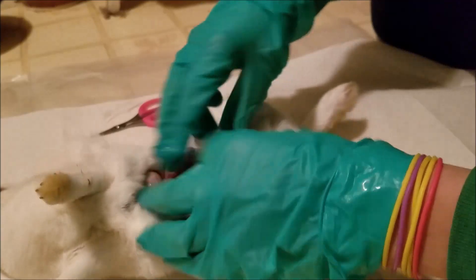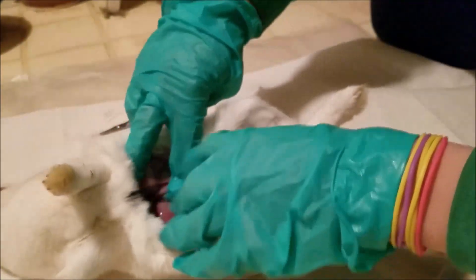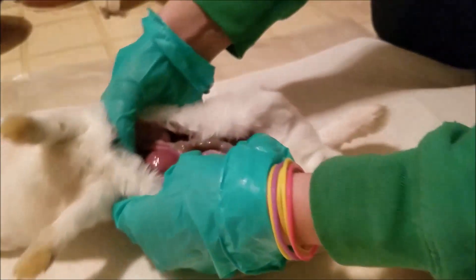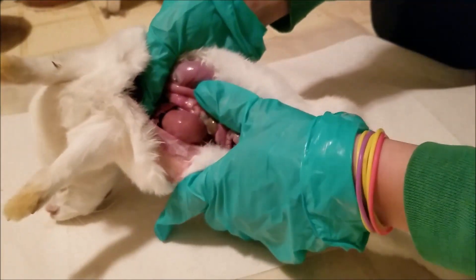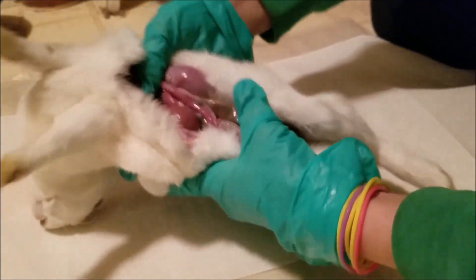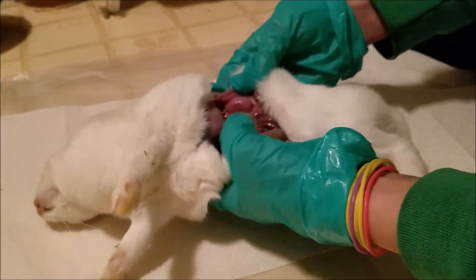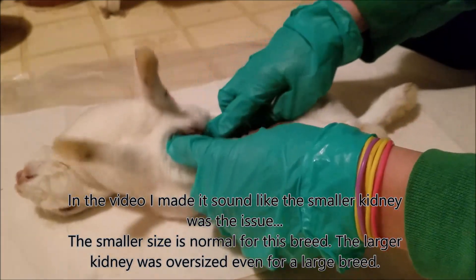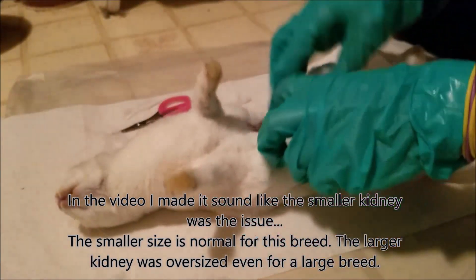Don't pull out the intestines and throw them away yet — we still want everything intact. Next we're going to check the kidneys. Here's something really interesting I noticed right off: look at this kidney — see how it's pretty large? A bit bigger than the size of my thumb. Now if we look at this kidney over here — very small, in comparison to my thumb. We're going to be pulling those out in a few minutes to take a look at them. I've noticed rabbits very commonly have kidney issues, so this isn't too surprising to me.